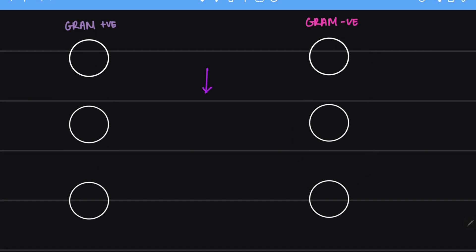We add crystal violet. Crystal violet will stain both these cells violet.